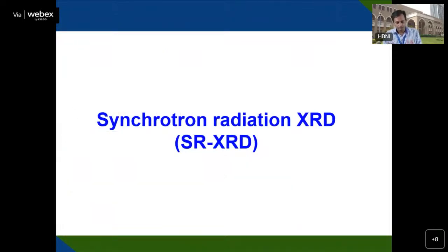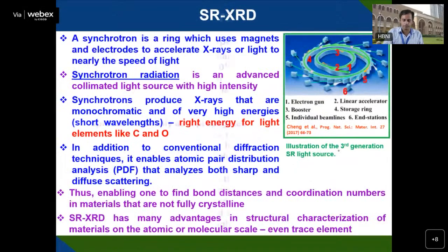So in normal X-ray diffraction or in this grazing angle X-ray, you use a copper K alpha source, a normal XRD source. In that case, the brightness of the X-ray as well as the flux is not that high. So when you go for synchrotron radiation, you can use energy from a synchrotron. Here the brightness and the flux is quite high, 10 to the power 12 to 13 order higher in case of synchrotron. In that you will get much better information. So that we will discuss here.